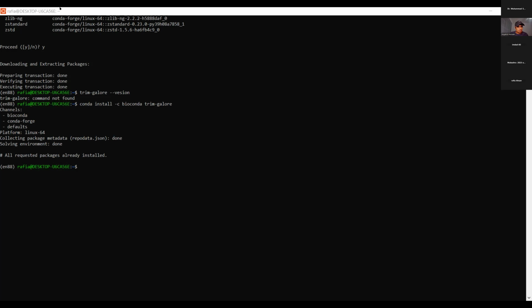So next, you need to install all the other packages to run this pipeline one by one: MultiQC, STAR, SAMtools, and Subread.